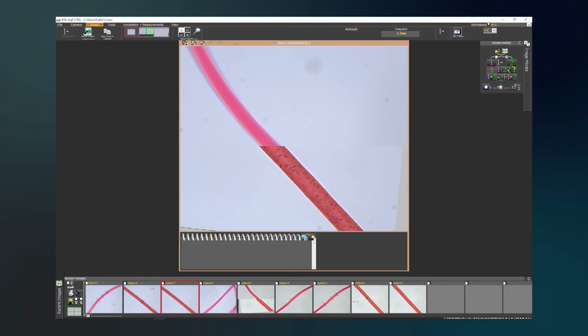So here we can really point out the differences between the fibres. We could put on a strobe effect, so we can strobe between image 1 and image 2. And with a split image, we can of course capture that in here.